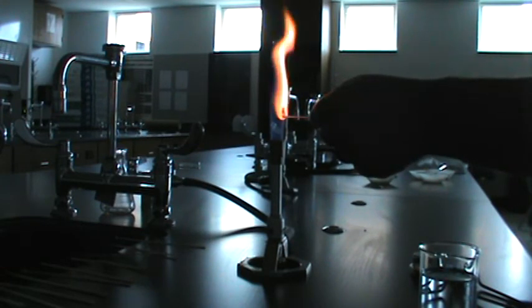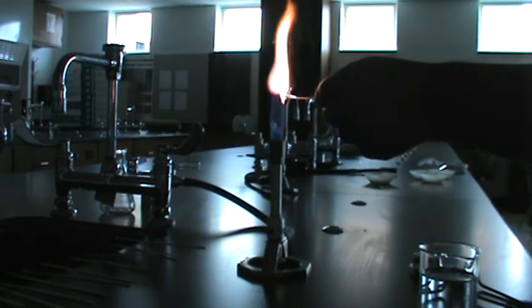Hopefully you can kind of see. There we go. Alright, then the last known is lithium chloride. We're looking at lithium.